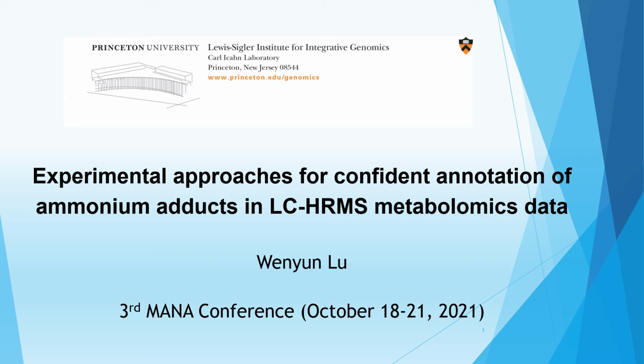So I will be mainly talking about some issues in analyzing untargeted LC-MS data, especially the annotation of ammonia adduct.